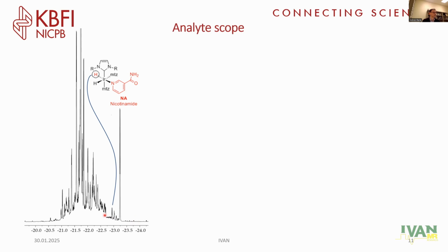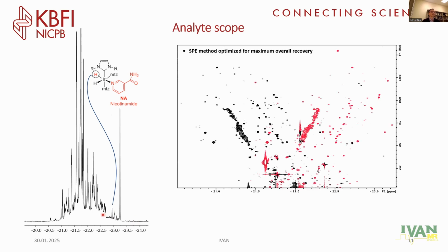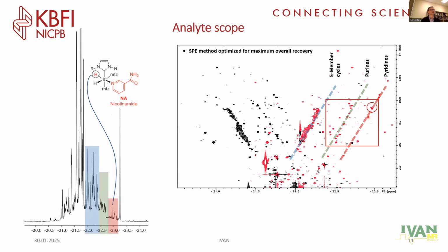But the spectrum is still quite congested, so it can be resolved in a two-dimensional NMR spectrum. And one important point here is that, remember, we are detecting or chemosensing these analytes via these atoms here. It doesn't carry any normal NMR structural information, but it's not completely lost, because analytes with similar chemical structure tend to show up at similar diagonal lines on this kind of NMR spectrum.